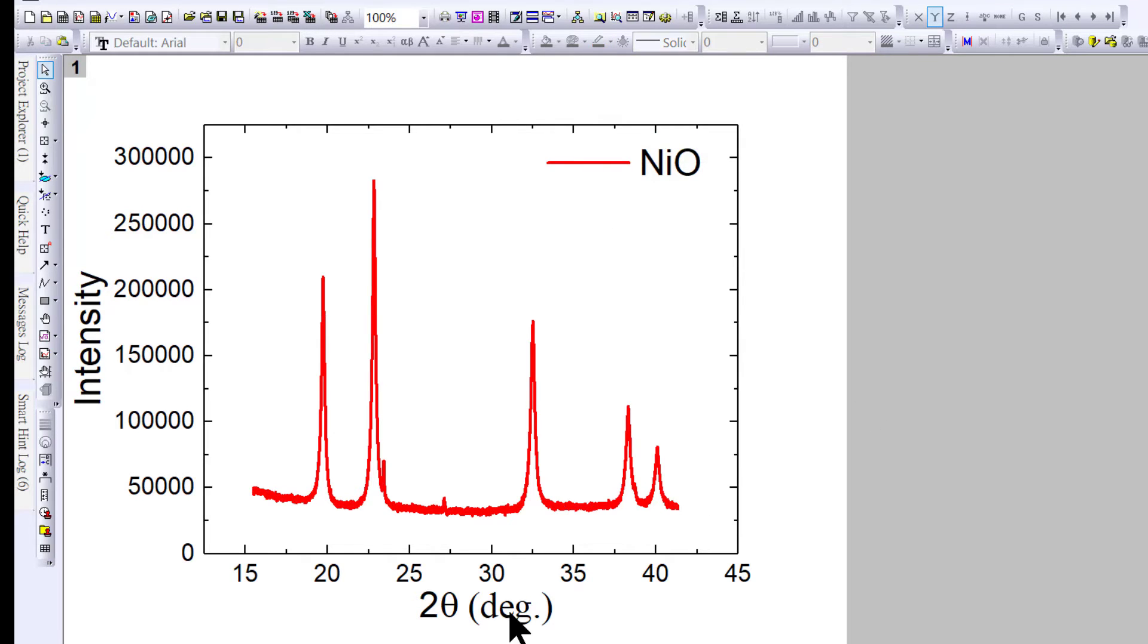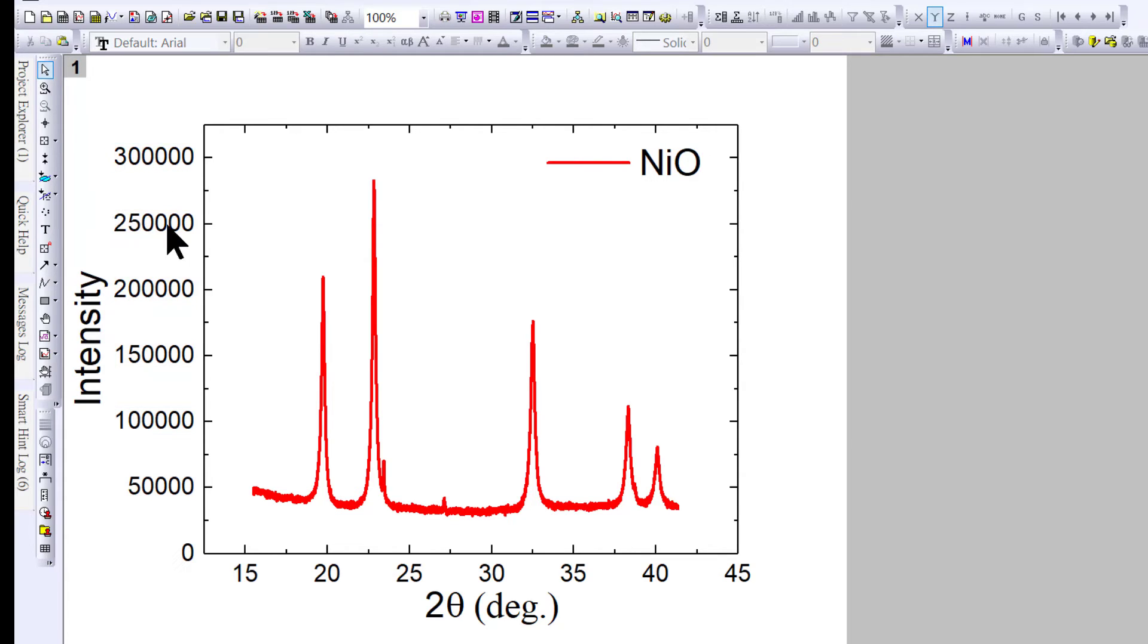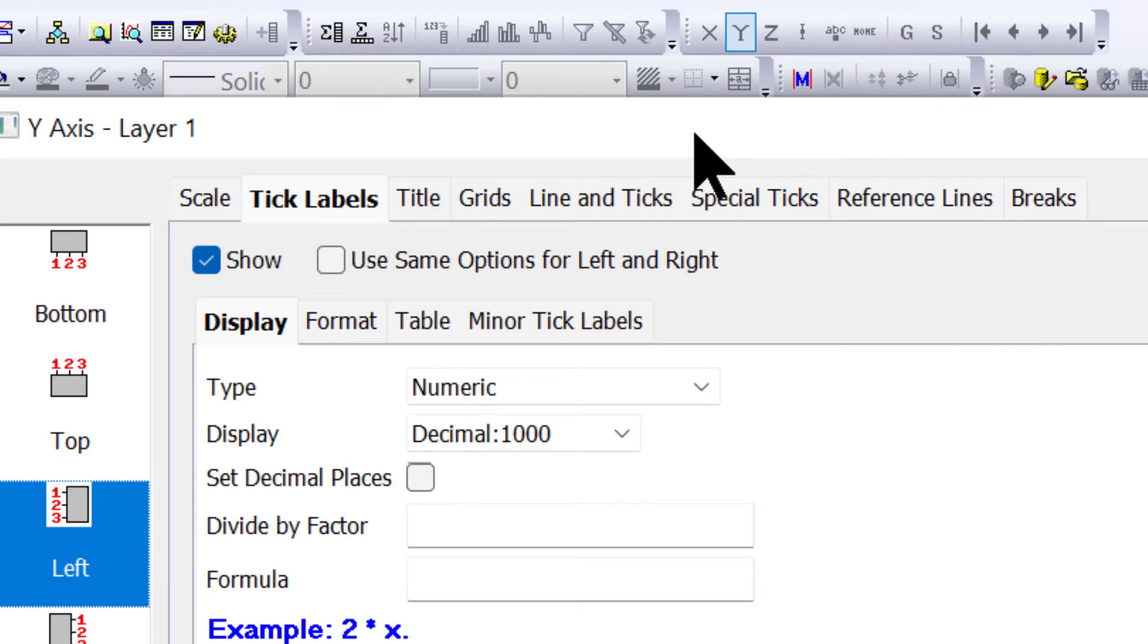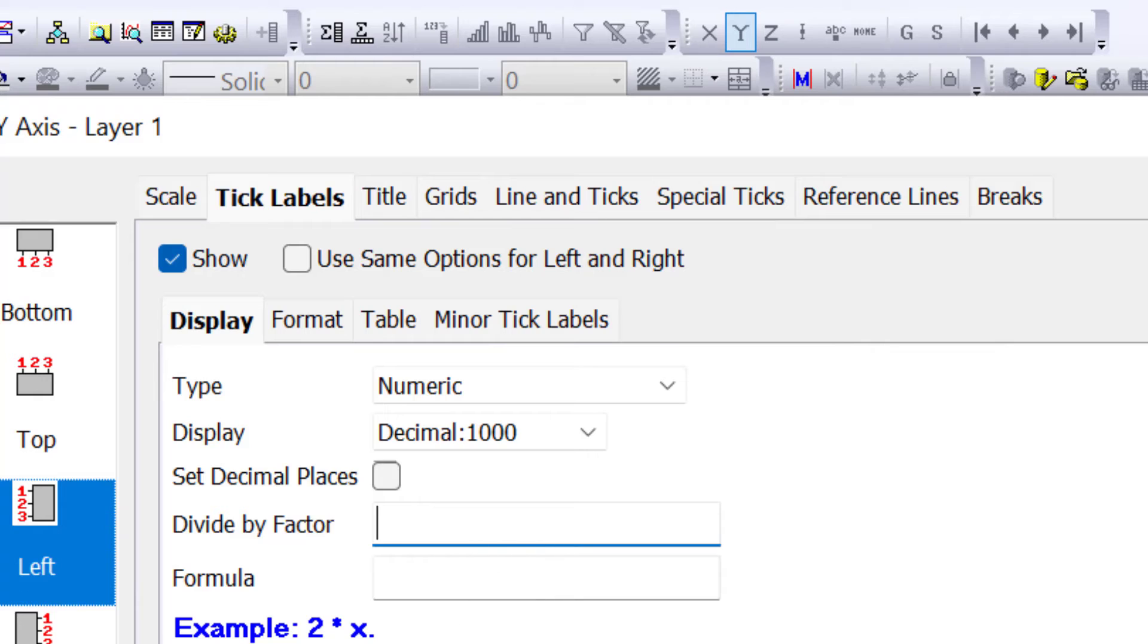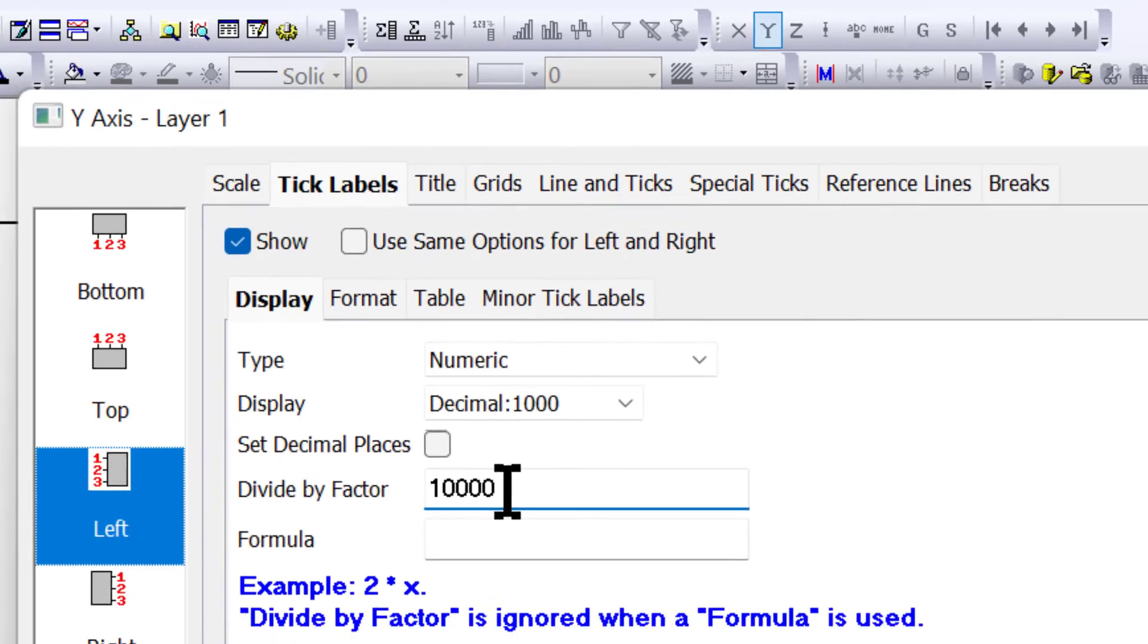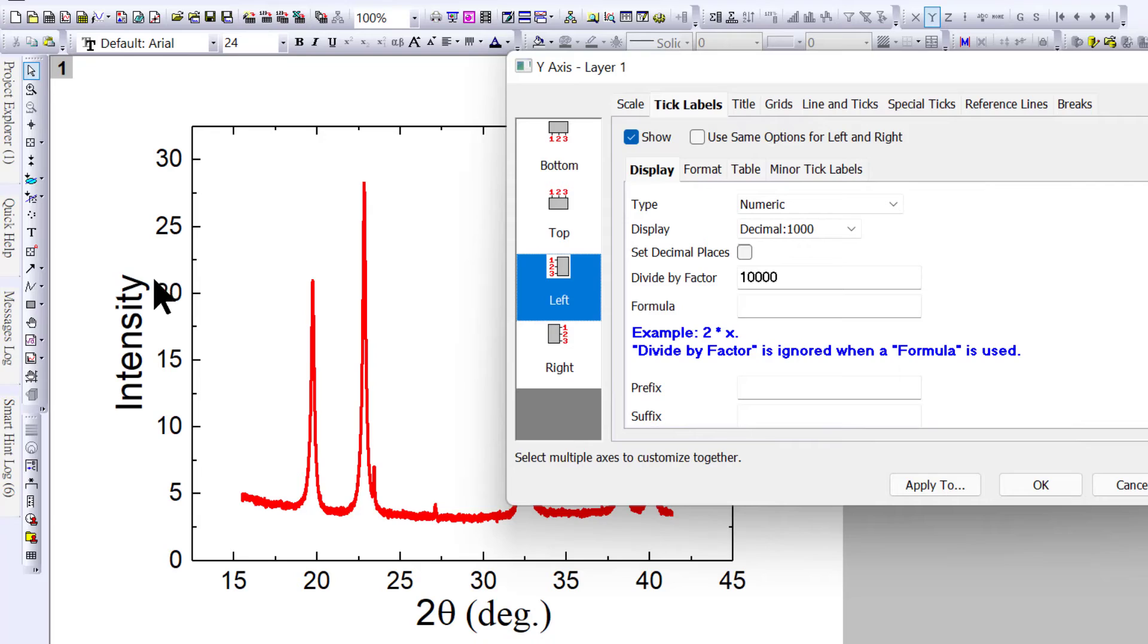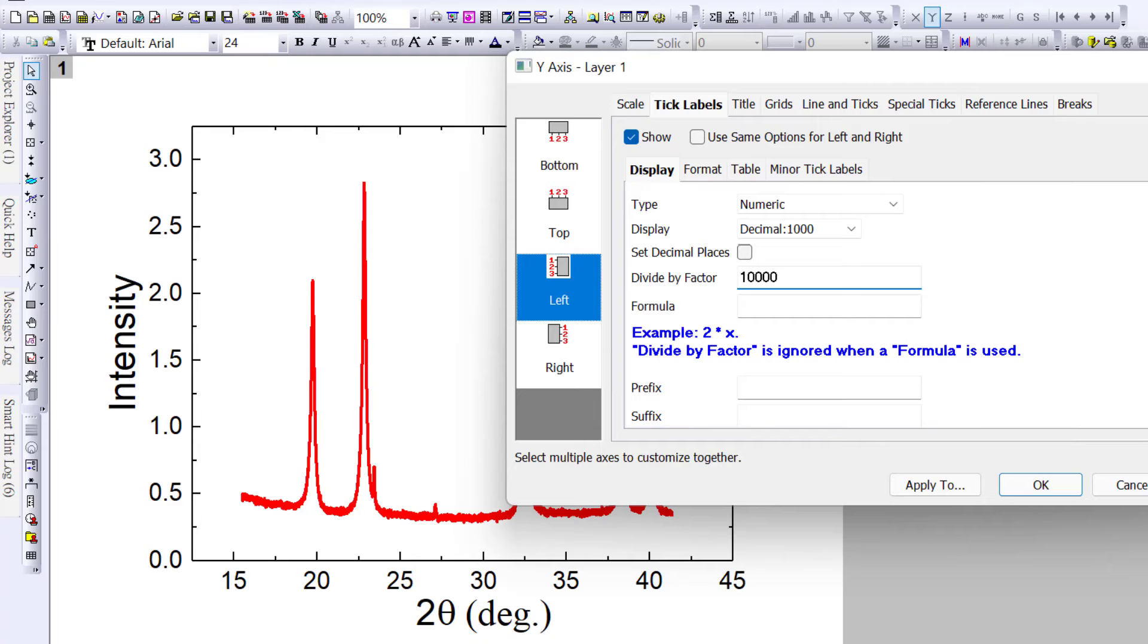Now you can see this number is too huge—almost three lakhs. To change this, double-click. You'll see 'Divide by factor,' so you can divide this number. For example, we can divide by 10,000 and apply. You can also use more than 10,000 or 1 lakh for decimal places, but it's better to keep 10,000.